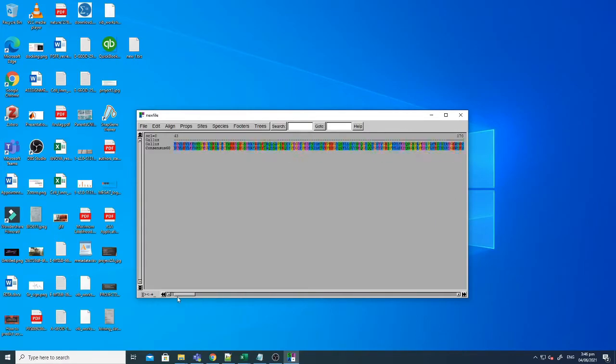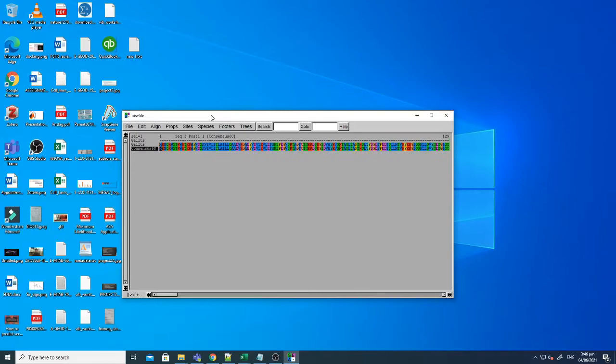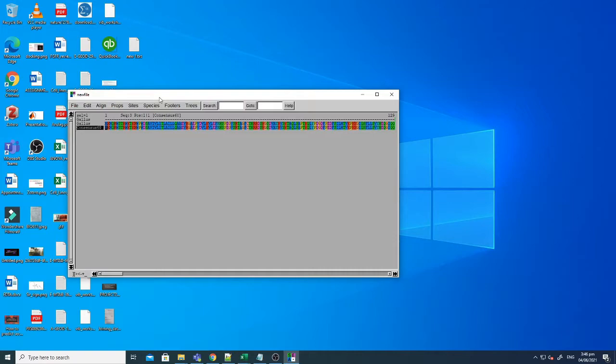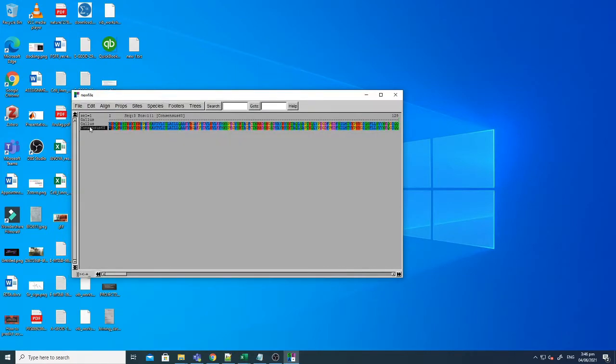You can see that the third row is the consensus sequence and you can use this for these two sequences. So this is just a sample example and if you want to use your own research and your own sequences you can use that. You can also change them.